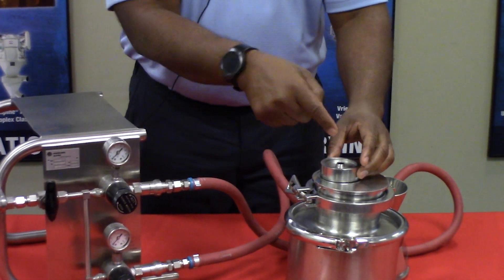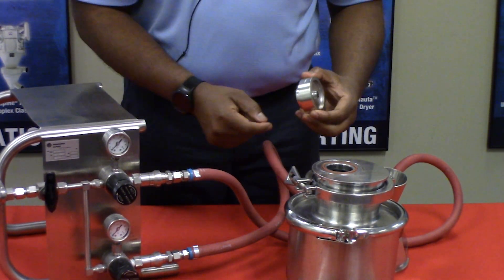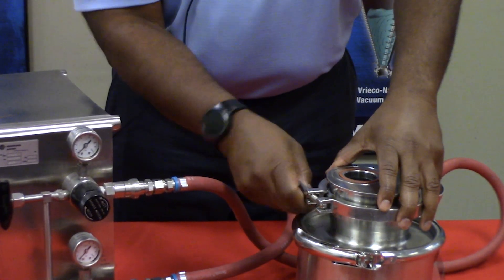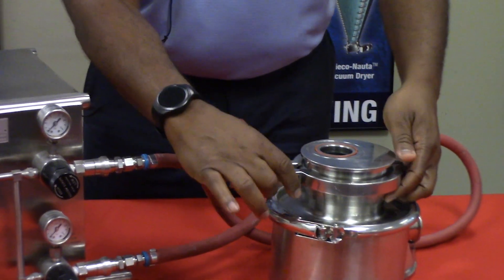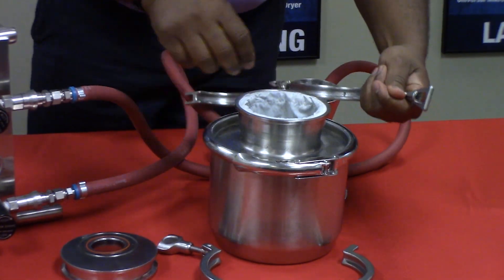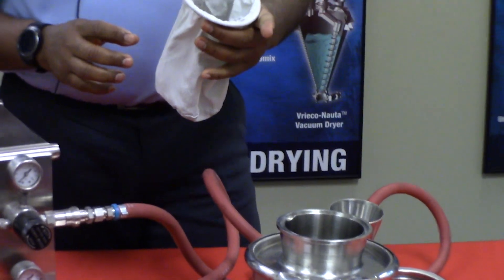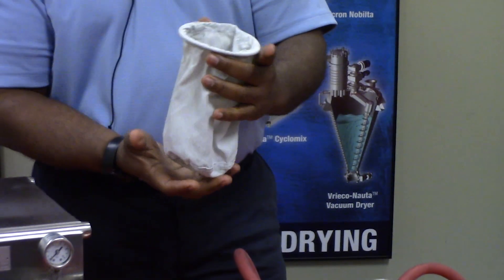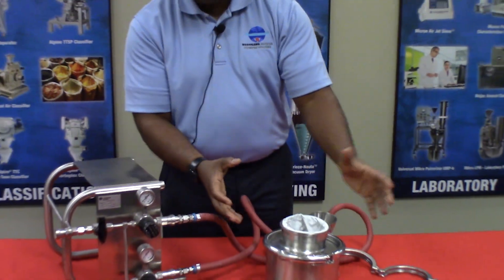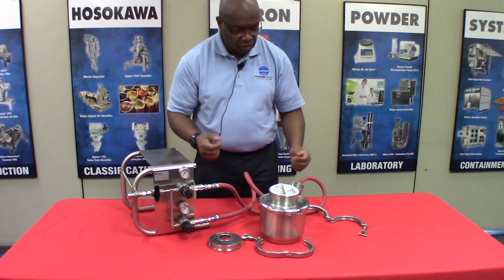Material, when it gets fine enough, is discharged via this discharge into the filter bag here. At the bottom, the material is collected inside this filter bag, which acts as both a filter bag and a collection bag at the same time. This is a one liter filter bag. For larger batch sizes, we have a five liter container where material deposits. Thank you very much.